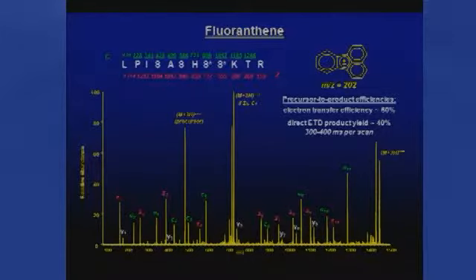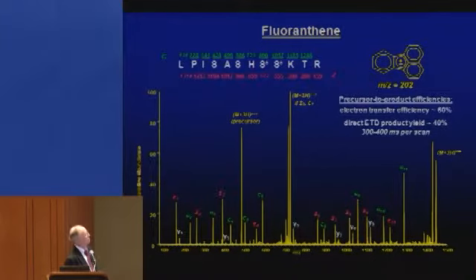The neat thing is that you produce a picket fence kind of spectrum. This one has a doubly phosphorylated peptide, but you note that there are a total of 5 possible sites for these two phosphates, yet it's totally unambiguous because this process does not affect post-translational modifications. It just breaks the amide bonds and disulfide bonds. Okay, so that's old stuff.